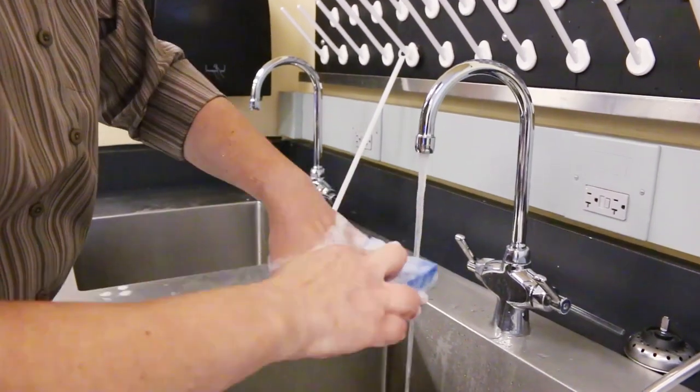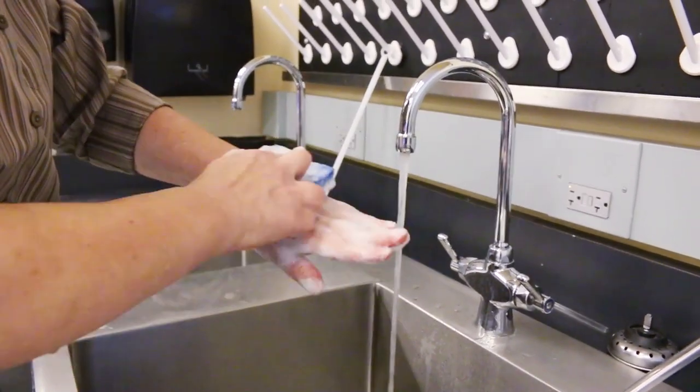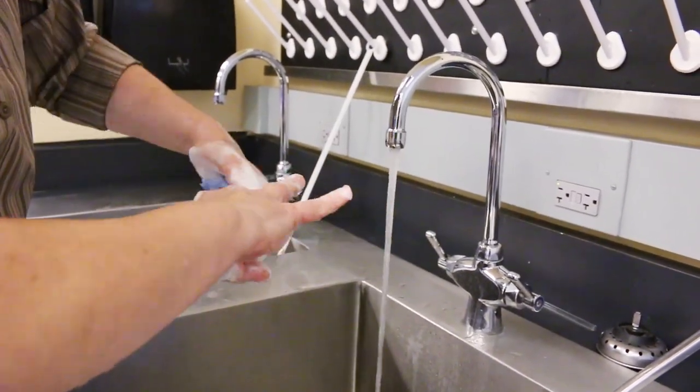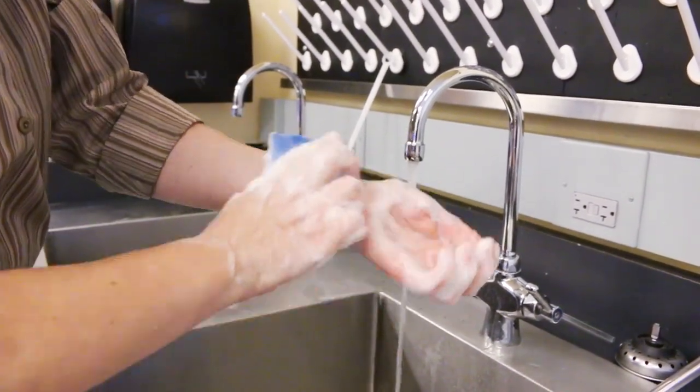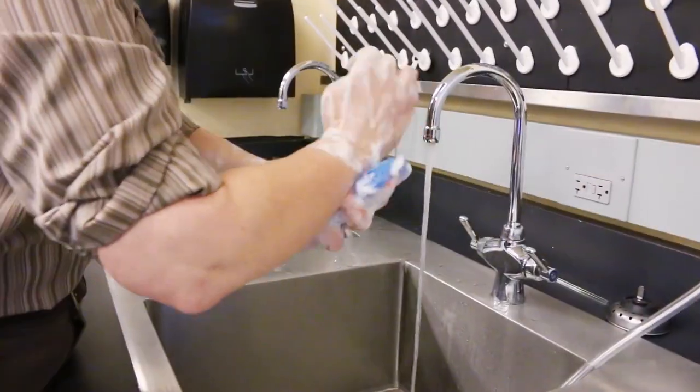Use the sponge to clean the palm of the left hand and repeat on the right. Step 15, clean your left forearm in a circular pattern around the arm from the wrist to elbow and repeat that on the other side.